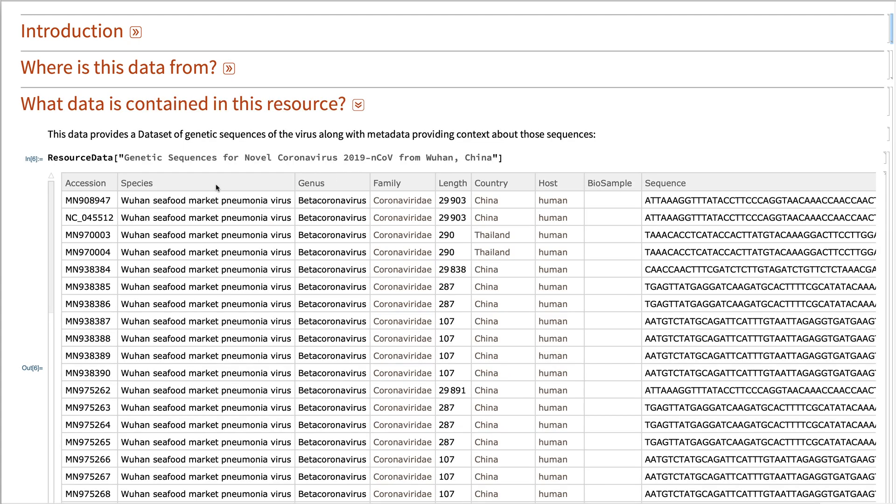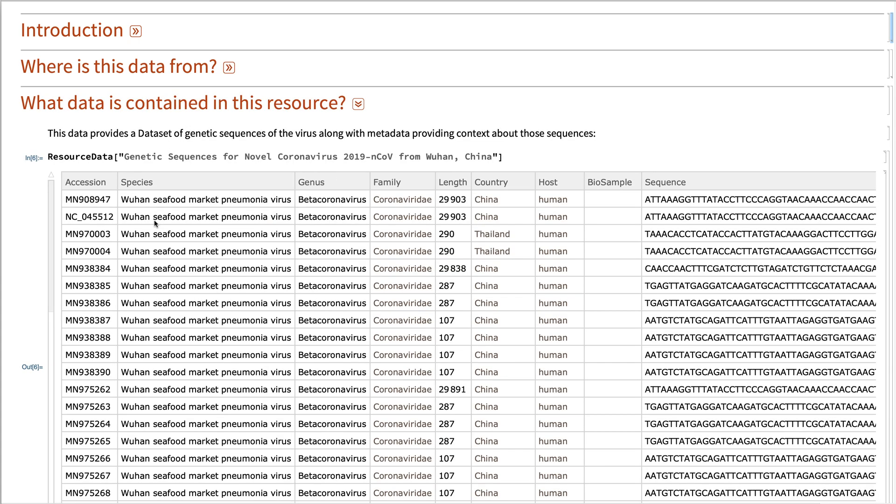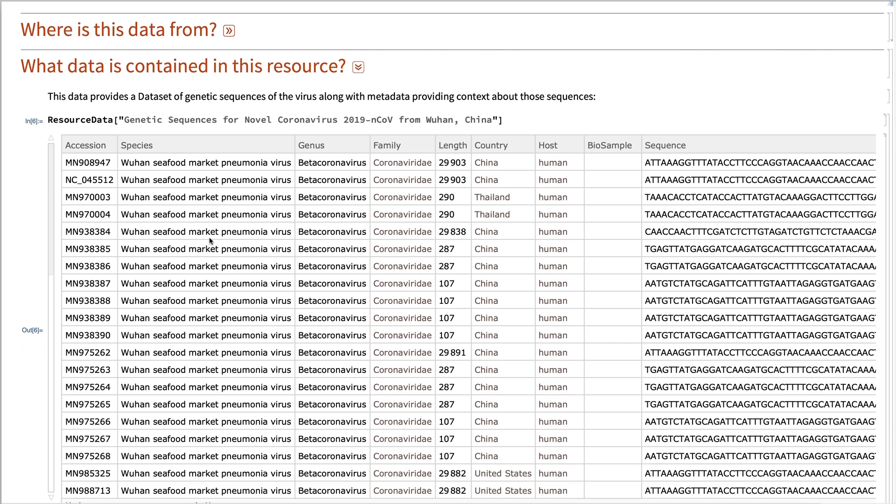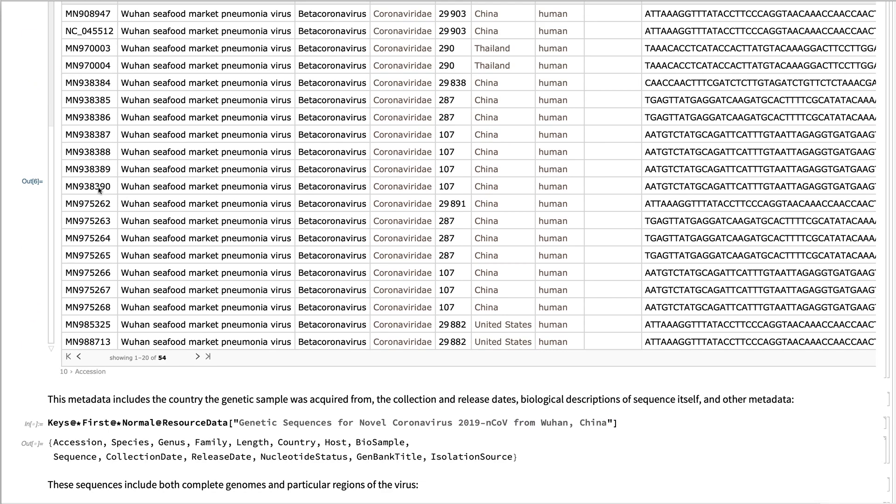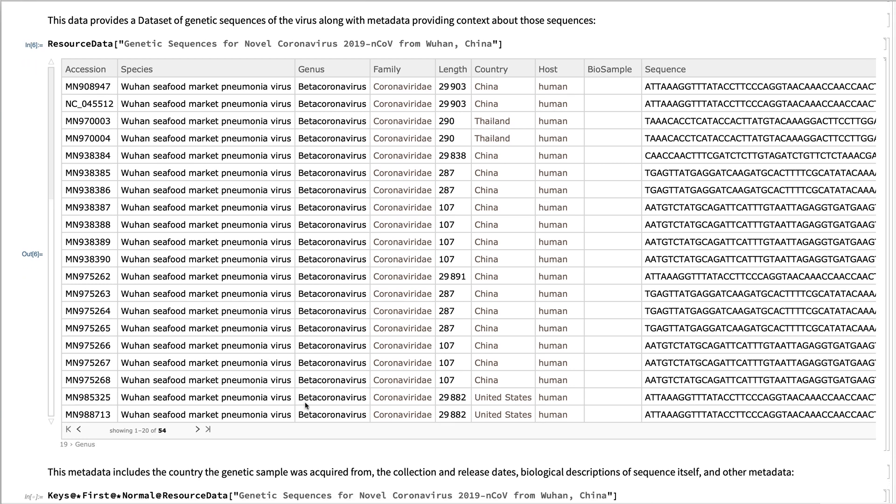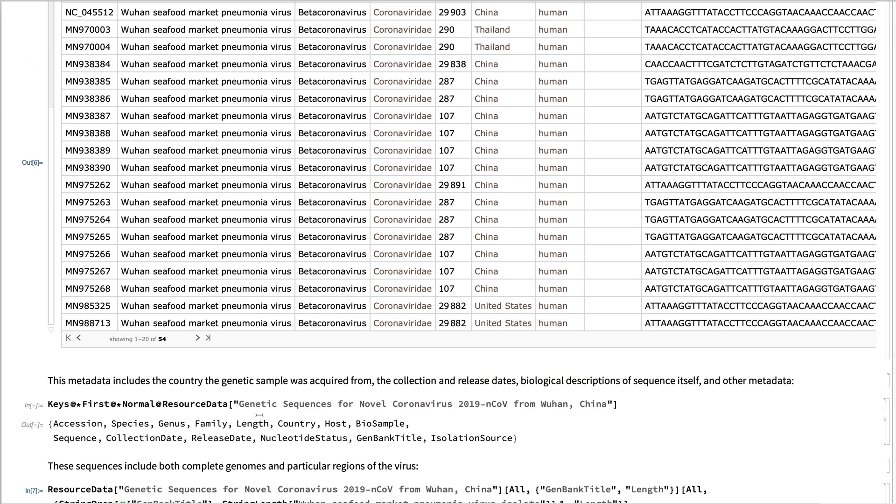As you can see, in this item, there's a nice dataset containing the sequences, the information about the species, where the sample was discovered, when it was discovered. Here we see that there's both the collection date and the release date.